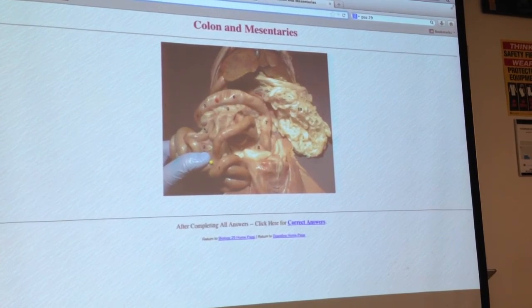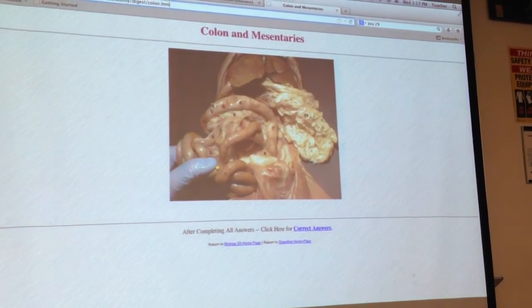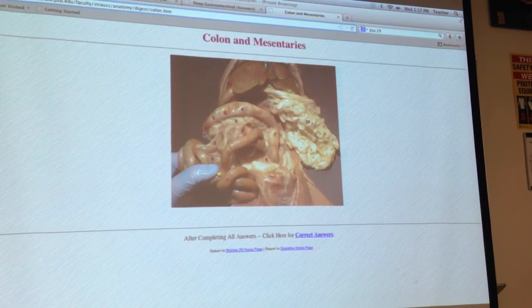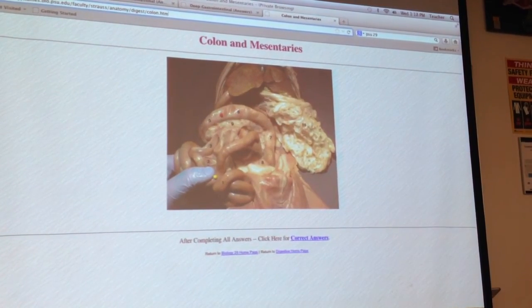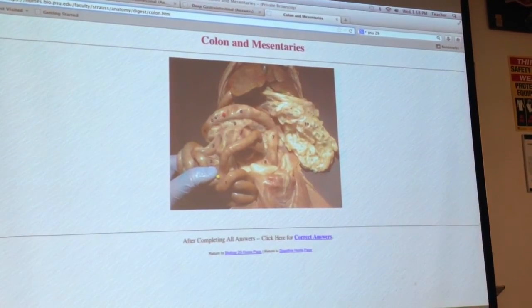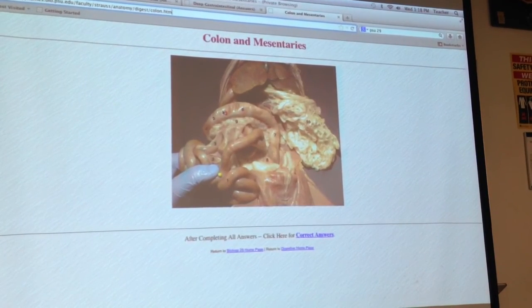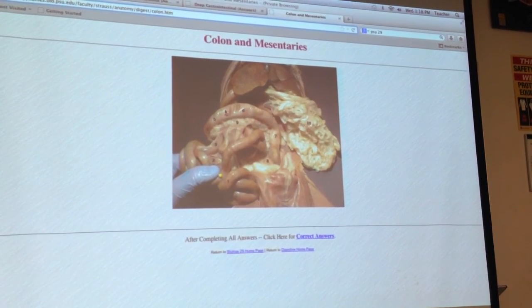So you'll be able to tell that this setup here is the small intestine going to the large intestine because you have this awkward jump in the line of things, and you'll see that cecum as the blind pouch that goes back. So now if we look at this large intestine, you'll see that they're calling this the ascending colon. That's kind of a hard thing to decipher, right?